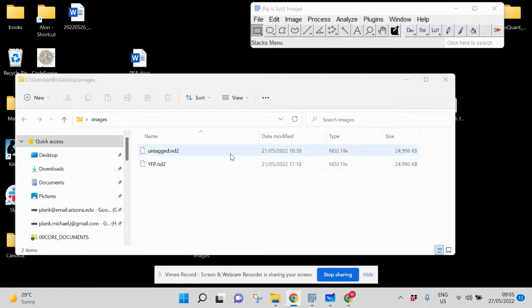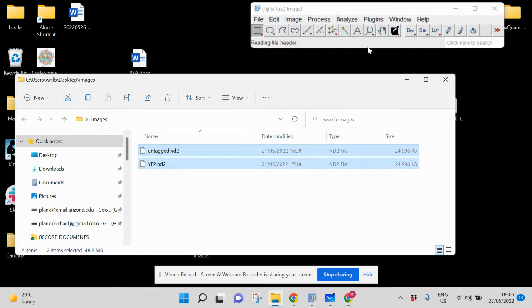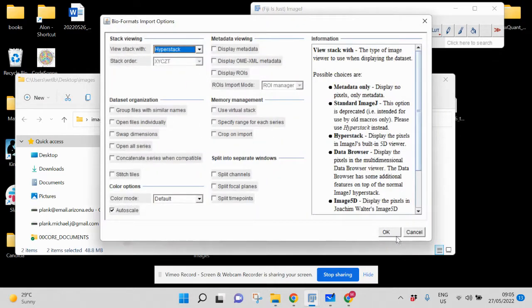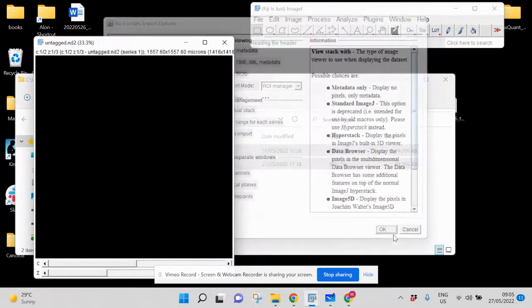What I have here are files for two yeast cell lines: one that doesn't have any fluorescent protein, and another that expresses the yellow fluorescent protein (YFP). We should be able to see clear differences between them. Let's go ahead and load those into ImageJ at the default settings.